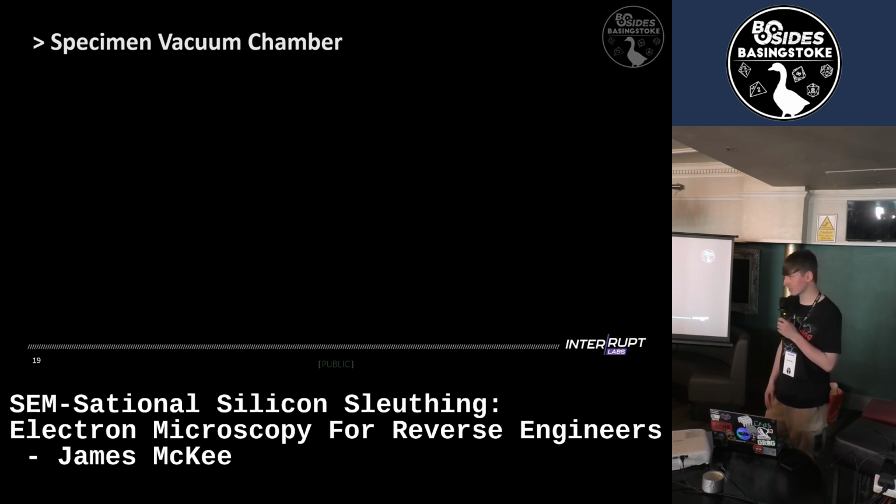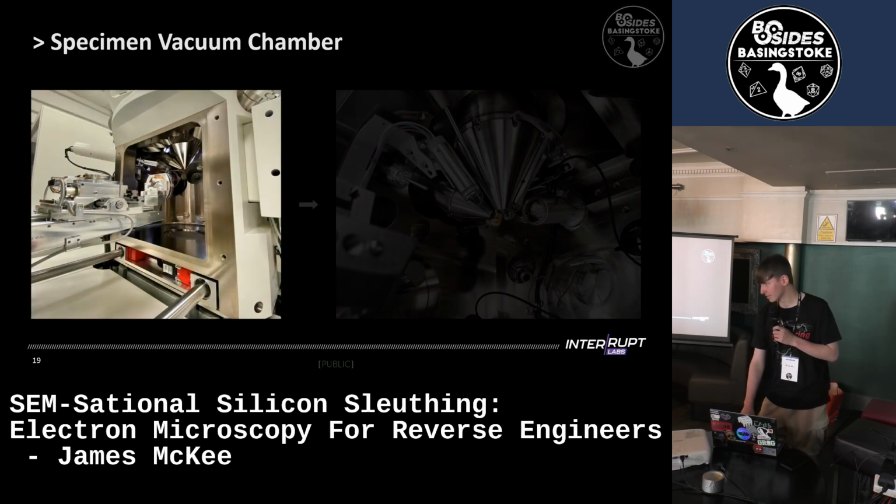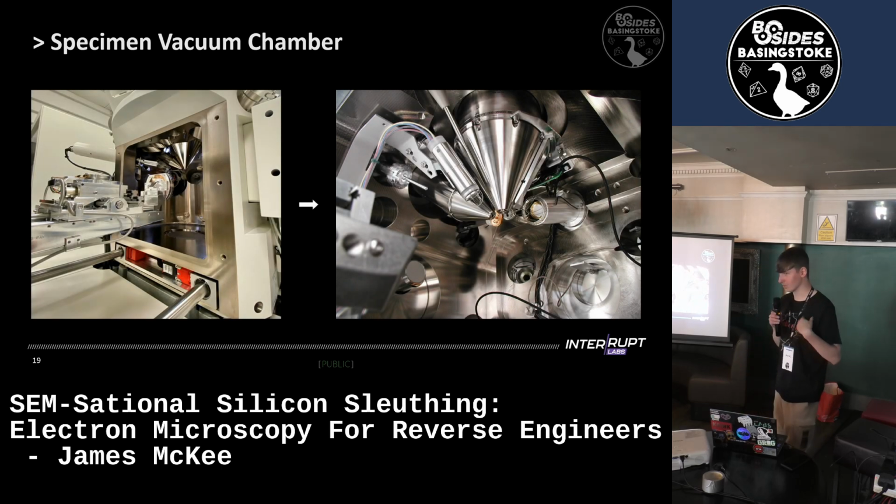For electron microscopes, it's not as simple as just putting your semiconductor die under it, like an optical microscope. There's a bit of an involved loading sequence for the vacuum chamber. In the old days, that would be venting the chamber with nitrogen, loading the sample in on the sample holder, putting the whole thing back on, and pumping back down to high vacuum. It's a bit of a process, worrying about fingerprints and hydrocarbons, which are not friendly.